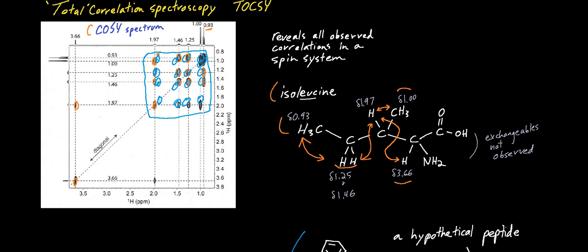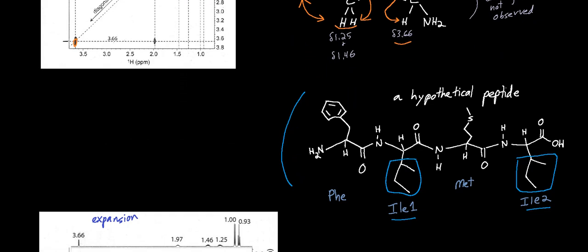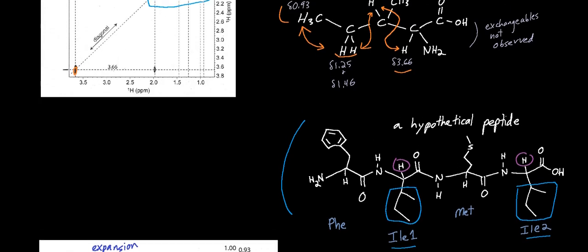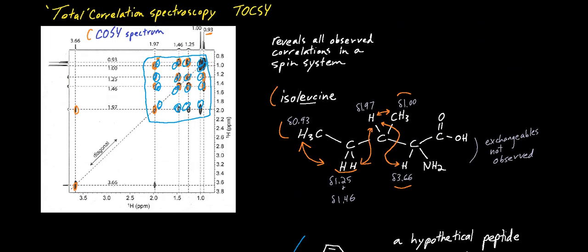Now, what we're betting on often is that the alpha proton, as it's called, here and here, are going to be different enough in chemical environment to offset. And if we go back up to the spectrum, let's say we would have another signal here, for example, of some multiplicity, and some cross peaks there, for example, that are offset enough.